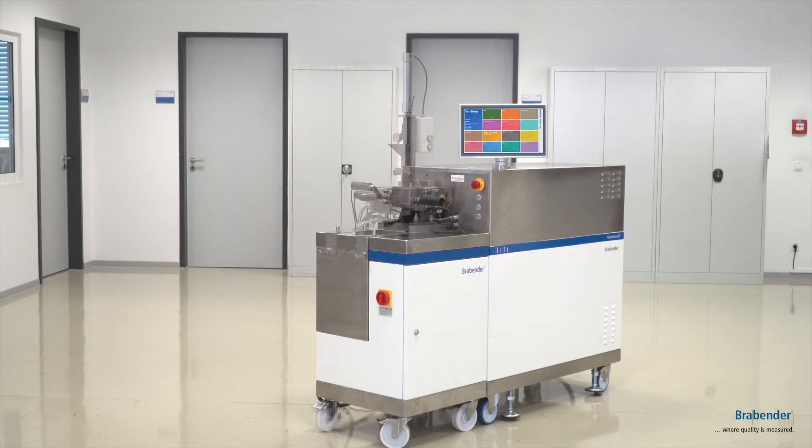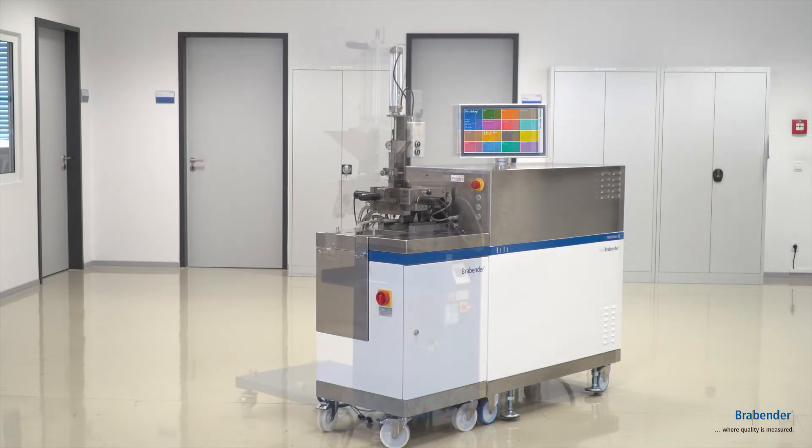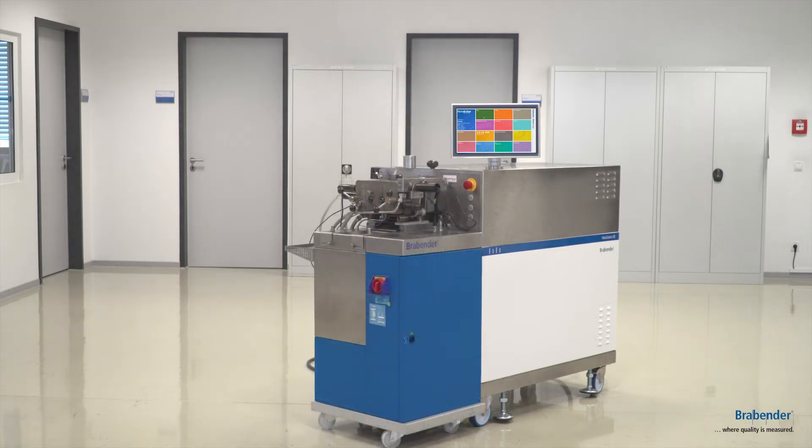With the larger units, you have the opportunity to attach even bigger attachments like our twin screw extruders or our biggest kneaders like the 350 one.